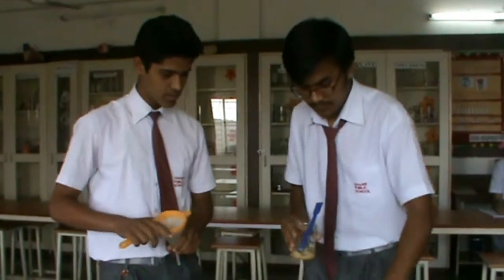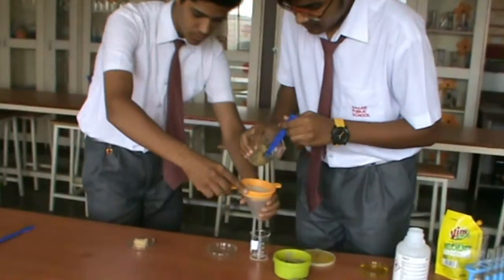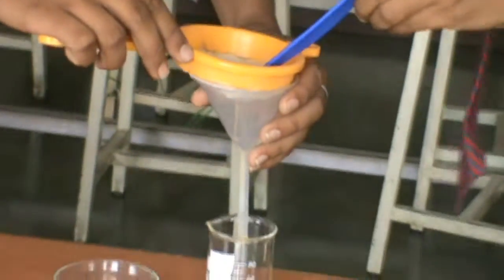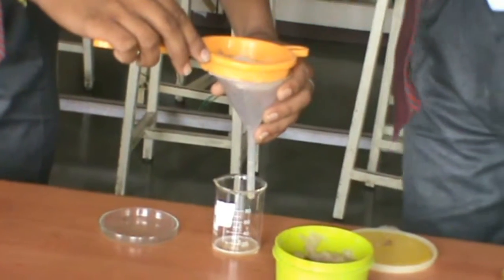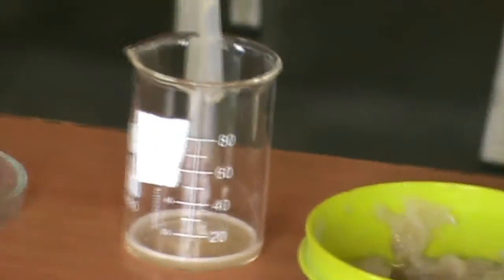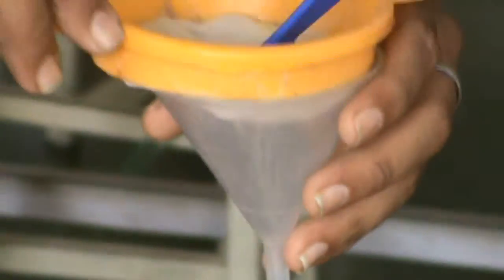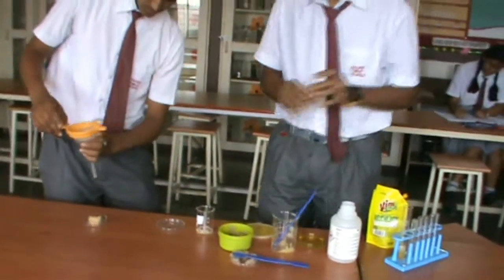And then using this funnel and filter, we will filter up some filtrate from this solution. And now we will take this filtrate in our test tube.